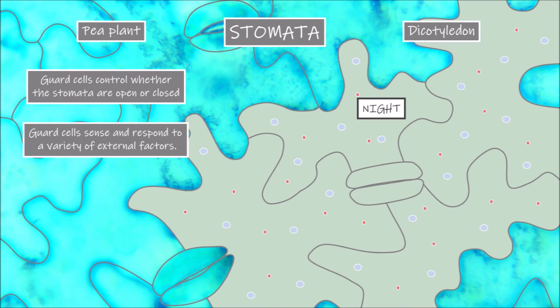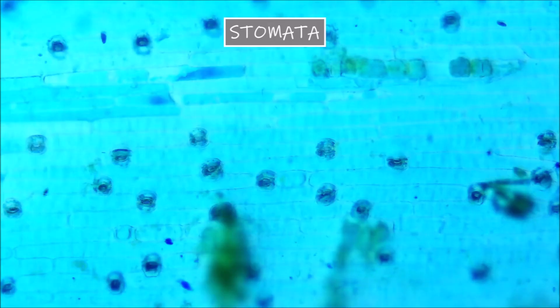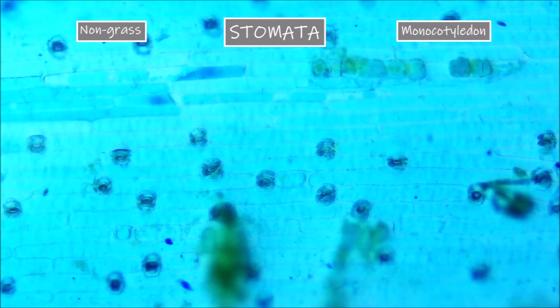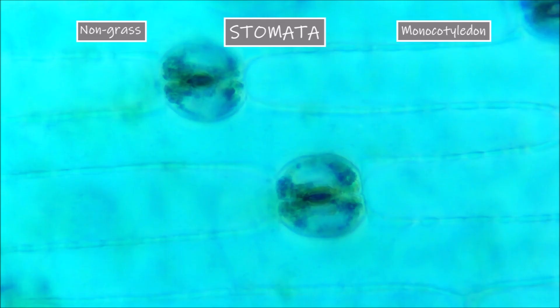In dicotyledons such as this pea plant, we have seen that the guard cells are kidney shaped. But what about the guard cells in monocotyledon plants? If we take a look at this non-grass monocotyledon, again we can see a whole bunch of oval shaped structures, which are again the guard cells that surround the stomatal opening. Unlike in the dicotyledon leaf surface, the epidermal cells in monocots are more regular and rectangular in shape. If we go up to a higher magnification we can see that although they are slightly different to those seen in the pea plant, the guard cells still have a kidney shape.